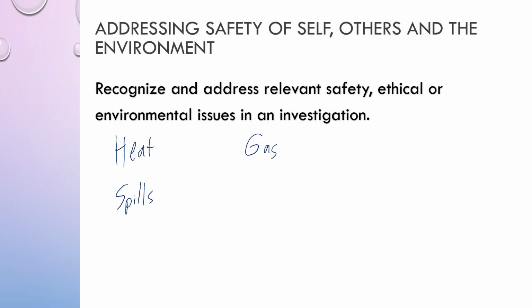Another thing to consider is if you need to wear any other personal protective equipment. So things like aprons or lab coats, long pants, shoes, tying hair back, keeping jewelry away. It's going to, again, be different depending on your particular lab and what materials that you're using.